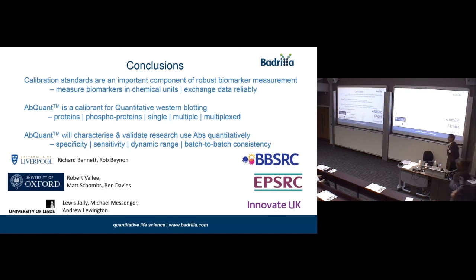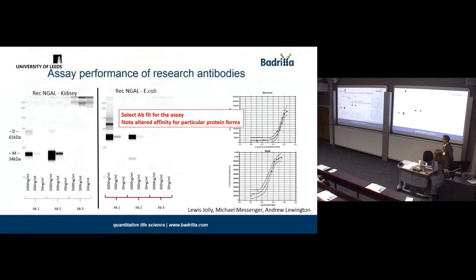I had a question about the previous slide and the lack of a dose response for antibody 1. Do you think that's because of the enzymatic detection you're using? Antibody 1 actually is the antibody that we've taken forward. It does have a dose response. It's very sharp. It is enzymatic, but so too were the earlier slides. It's exactly the same modality. So I think we've just got a very abrupt transition from the lower limit of detection to the top.